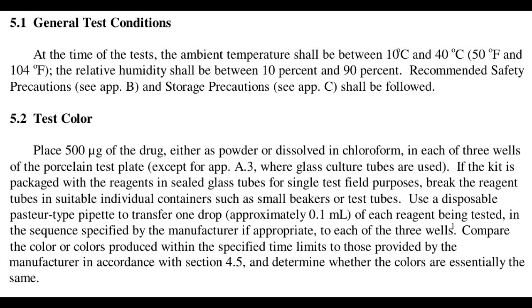In other words, whether you're in a desert or a rainforest, these things should pretty much work. If the temperature is too low, the test will be slow to react, or it won't react at all. That will obviously make the test unreliable, unless you've tested the reagent at those low temps with some kind of reference standard sample to see how it behaves. Similarly, if it's too hot, the reagent will react too quickly, and other chemical reactions that would not have been noticeable at lower temps may no longer be negligible at the higher temp.